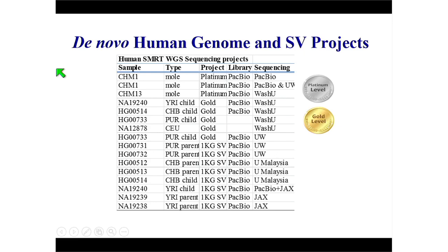And the mission is really twofold. Develop more comprehensive structural variation that goes, at least understandings of genetic variation from really the 2 base pair level to the 20 to 30 kilobase level. And at the same time, build new references where we're actually going to create entirely new references that are going to be representative for different continental groups.